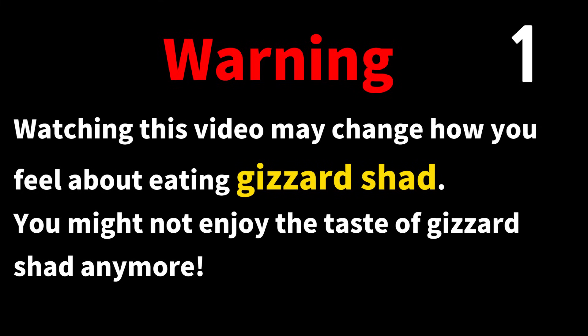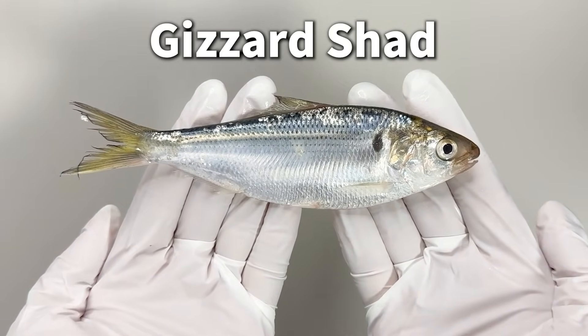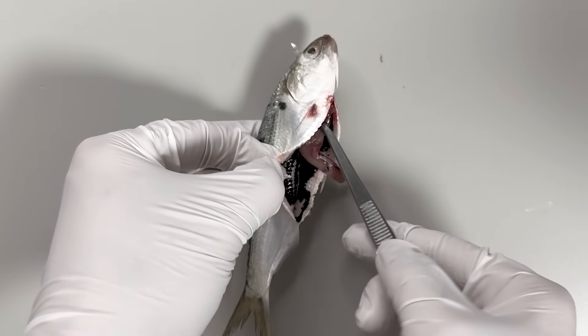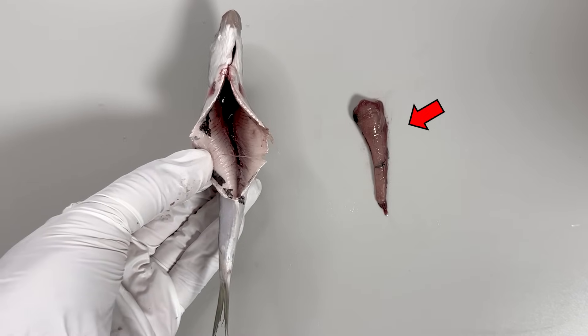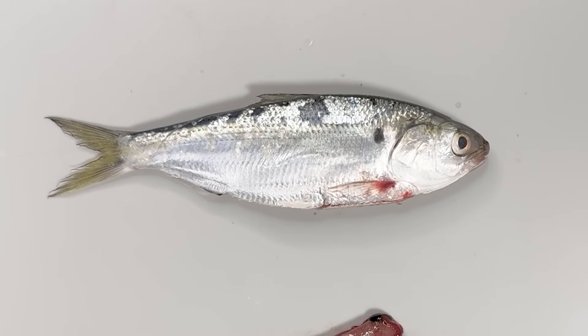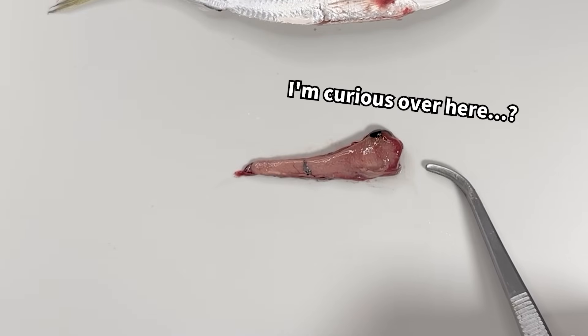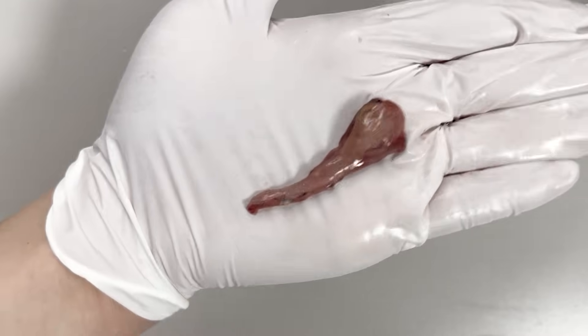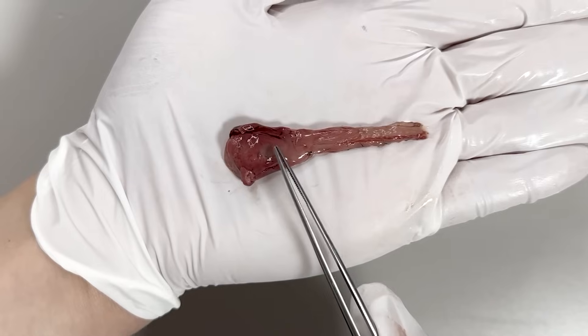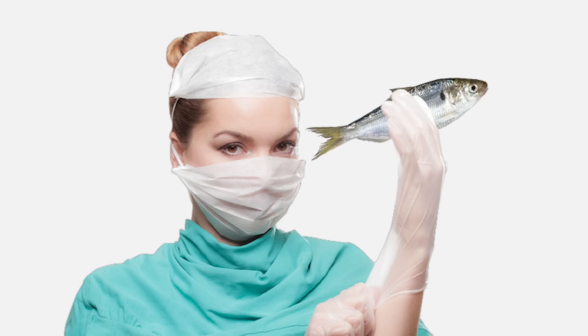You might find this a bit unsettling. This is a Gizzard Shad, or Kohata. The internal organs have been removed from the body of the Gizzard Shad like this. In most videos, the muscle part of the body is used. Here, however, we are focusing mainly on the internal organs. Did you know that the internal organs of the Gizzard Shad conceal a very unusual organ? Today, we will dissect the Gizzard Shad.